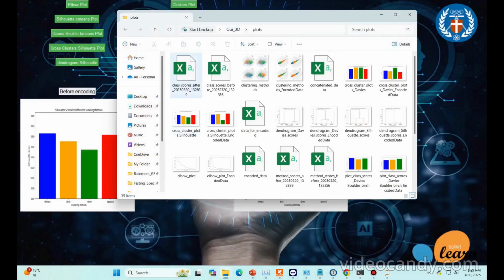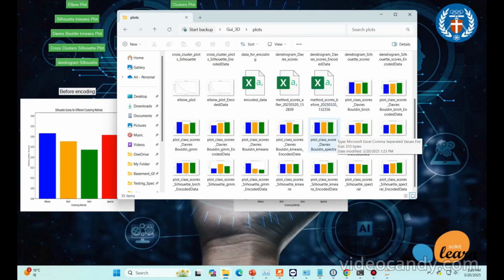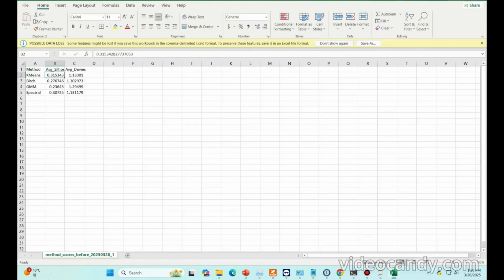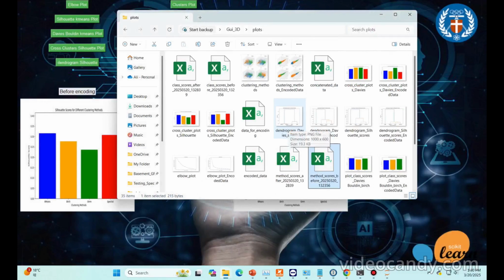So most of the time you can see the results are automatically saved, but one thing, you should delete the previous files if you want to change the separation power in the next round, otherwise they will be replaced. But sometimes the app will show an error while replacing the files, so it's better to delete the previous results, and then when you run the app again, it will save the results again in an empty folder.